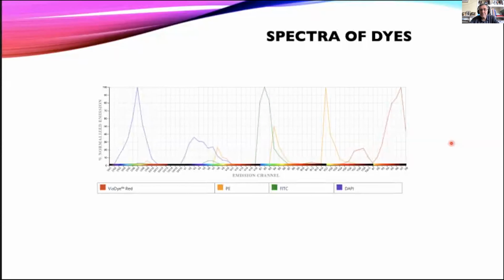Rui, you've come on screen. Is there a question? Yes. Just before you go on, there was a question by Sadhana, who's asking, why do we need to exclude the dead cells if we don't intend to perform any culturing after?